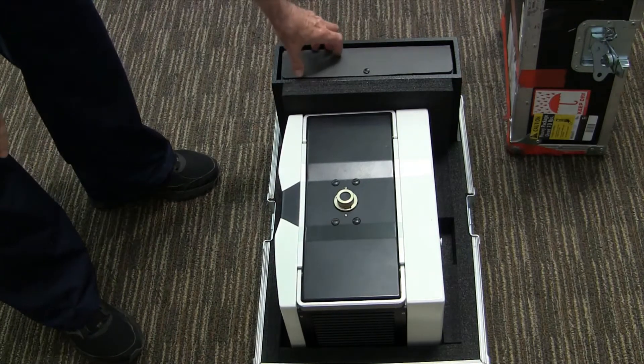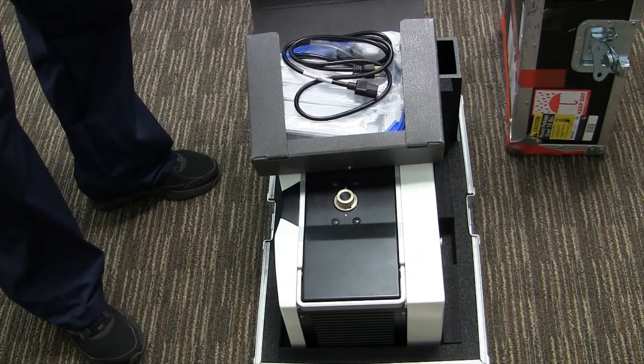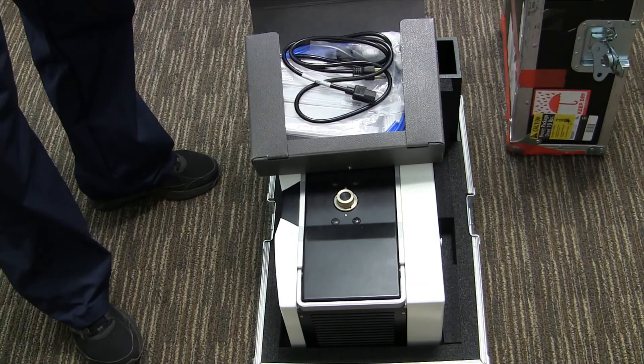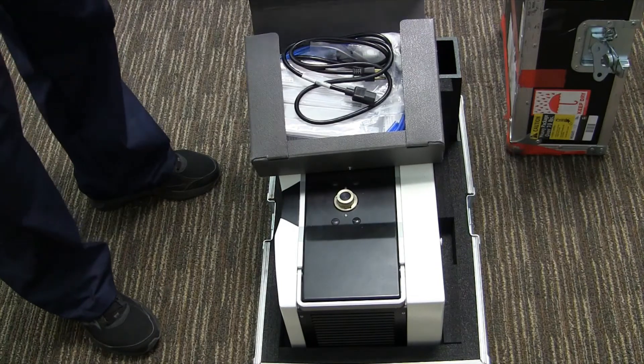Over here are the accessories — anything that was shipped with the system. This includes glassware, resonator tubes, power cord, ethernet cable, as well as tools to install some of the accessories such as the barcode scanner or the ruby crystal. After you're done, make sure you save these so as not to lose any of the tools.